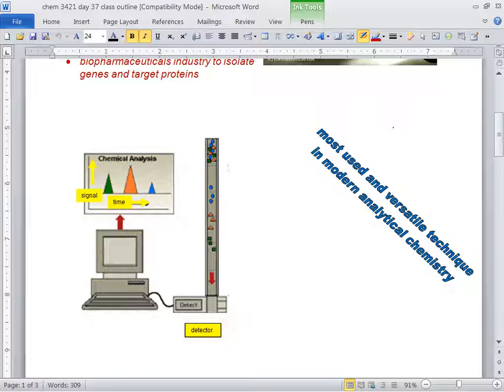So as a little flow diagram of what's happening, there's this little picture. Everything is supposed to be moving this way. And at the top you have this jumble, right? You just dumped in everything, okay? And then the magic happens. Notice how these things start separating out. They start traveling down this path at different speeds. And it looks like the blue guys are the slowest. Something's going on, then these guys, and then these guys.